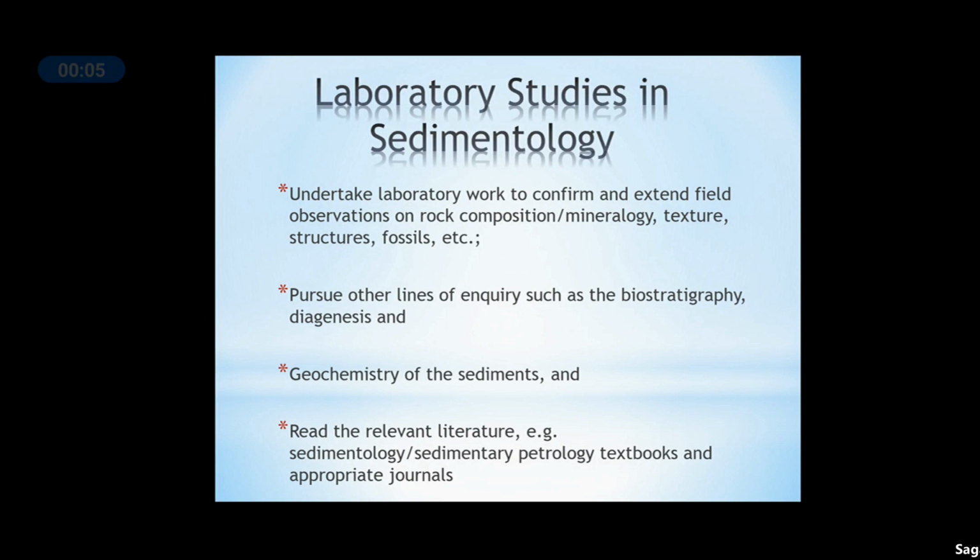Previously we discussed the geological field studies, the important things or aspects that you need to remember during the field work. Now today we are going to see the second part of the geological analysis. Once the samples are collected in the field, these samples are brought into the laboratory for analysis.